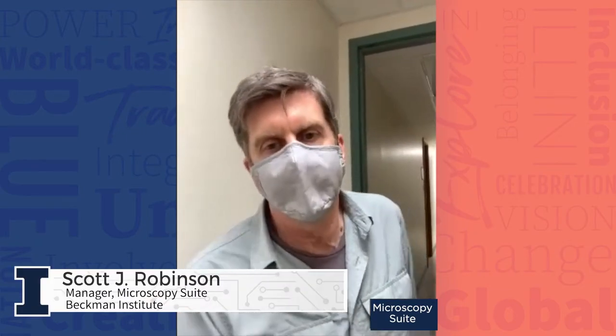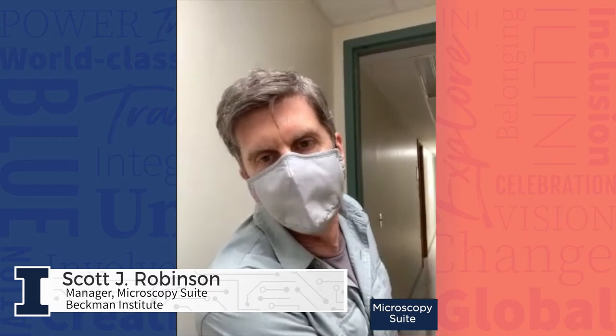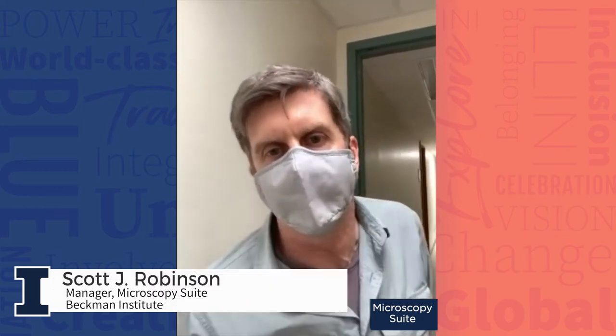We're going to go backwards, as far as the suite goes in this direction, and then we're going to go back to the main part of the suite.